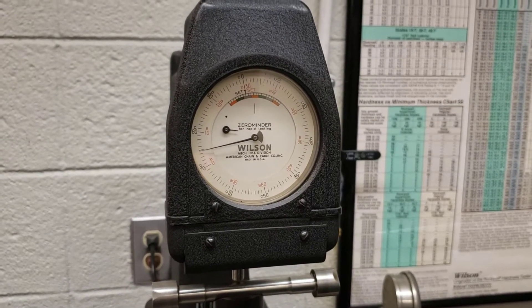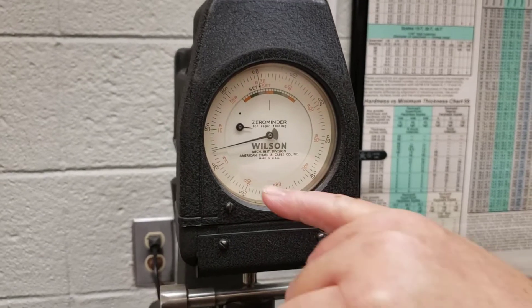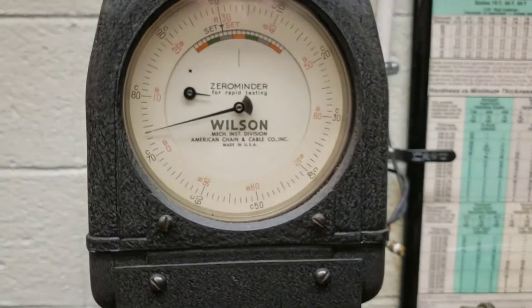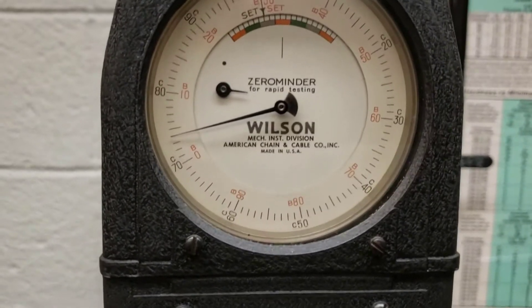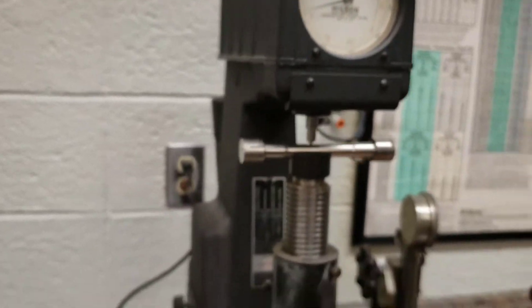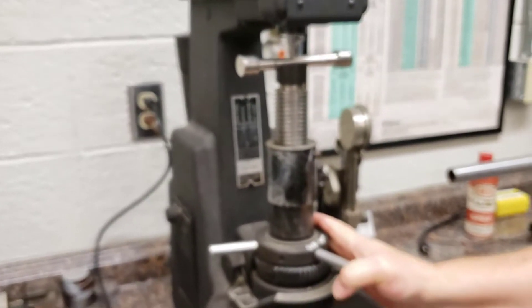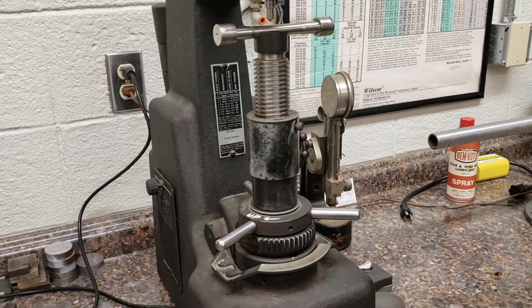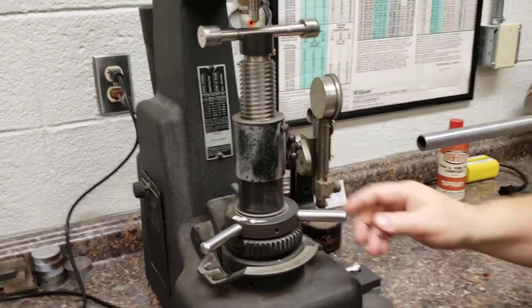This is a piece of tool steel, and no surprise — the reading is 74. So HRC 74. Simple as that. Drop it down, take the rest of the load off, and you're good to go.